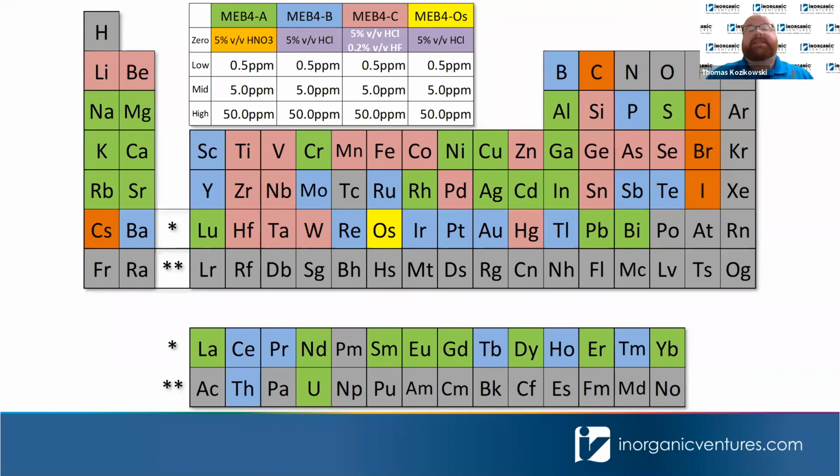We could add this calibration set to our run and just add an extra 4 standards to the set, and then be able to get values for osmium too, along with everything. The only thing we have to do is switch out our waste container to an osmium waste container, because we treat that separately from our normal acid waste.